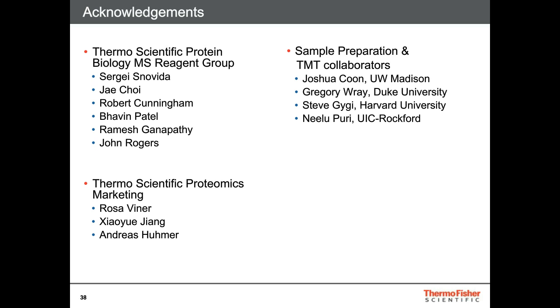And the high resolution required that's actually provided by the Orbitrap instruments is necessary to separate the 6-plex tags into the 10-plex. So you need to have a resolution of at least 30,000 at m/z 200. Therefore, the Orbitrap Fusion and Lumos are the two instruments that have that acquisition method enabled. The Q Exactive series of instruments have Orbitraps as well, and the Elite and Velos Orbitraps can also have the resolution requirements to separate a 10-plex.